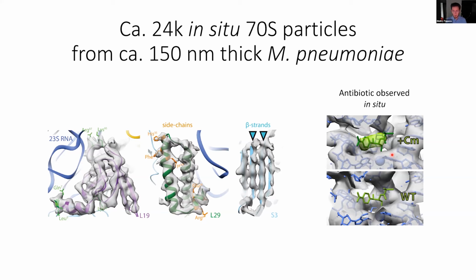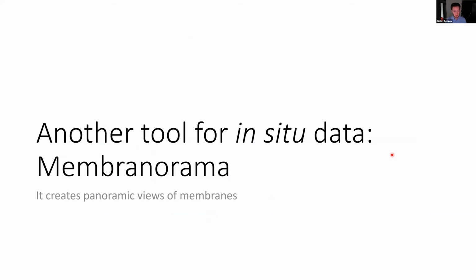Now, I promised you not one, but several tools for in situ data analysis. And initially, I wanted to show you some tools that we've developed for heterogeneity analysis with 3D principal component analysis and autoencoders, and a nice piece of software used to visualize and analyze those results further. But I think it's a bit too much for today, and instead I will show you something that is already actually quite old, but I don't get to talk about this very often.